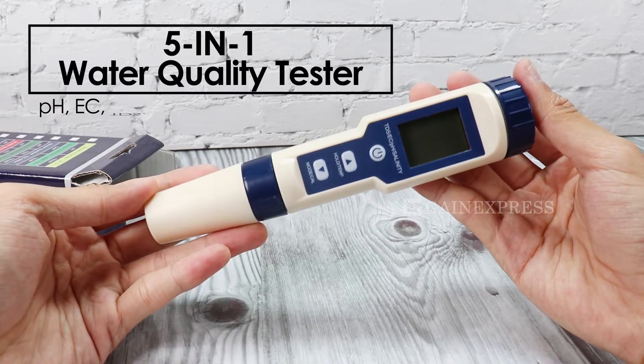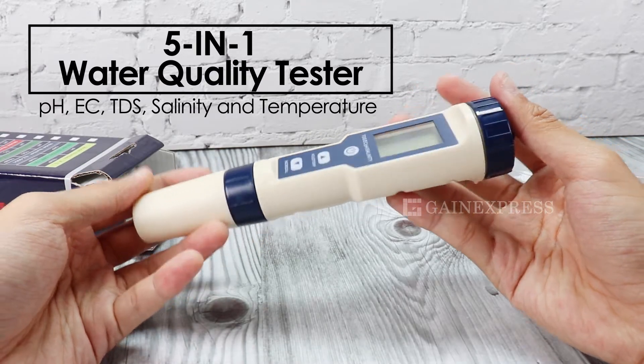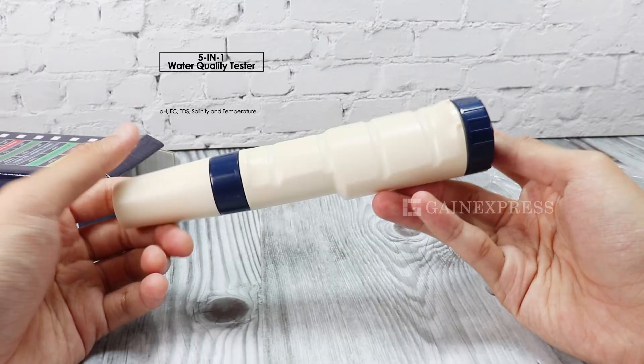This 5-in-1 water quality tester can measure pH, EC, TDS, salinity, and temperature.